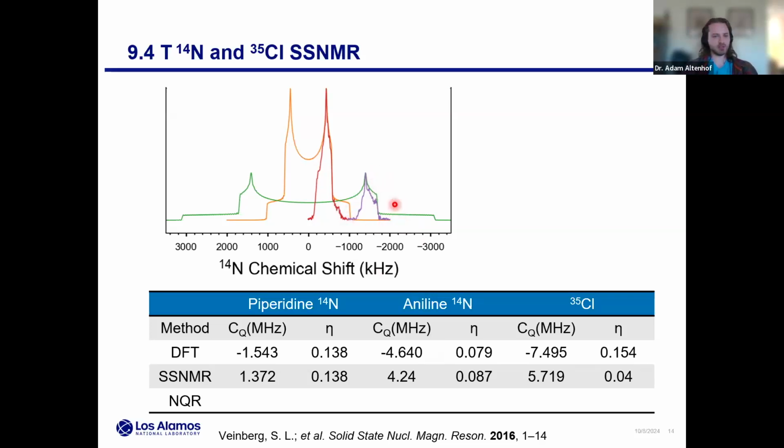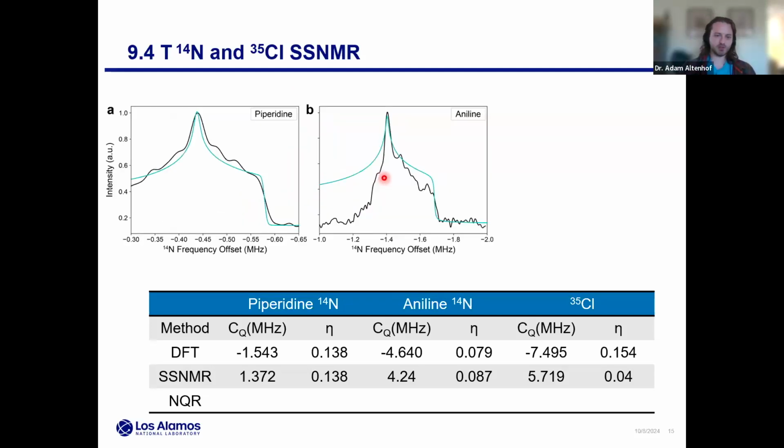If you haven't seen these experiments before, we talked about how broad these spectra are. Notice they're totally symmetric, so you don't need to acquire the whole thing, and you don't even need to acquire this whole half. You really just need to focus on these key discontinuities. That's enough to characterize the tensor. Because of the DFT, Harris knows where to tune his probe ahead of time, and this really speeds up the experimental times. Zooming in on those pieces, you can see the refined tensors we get from experiment.